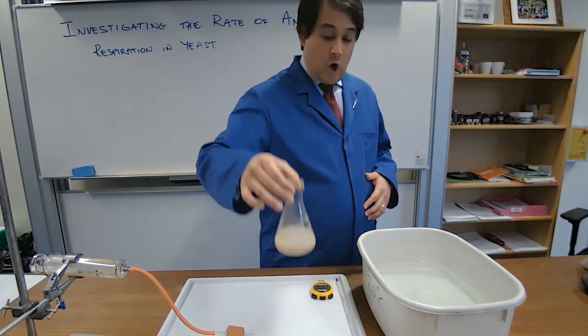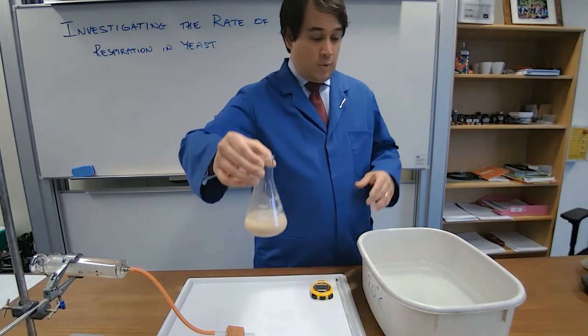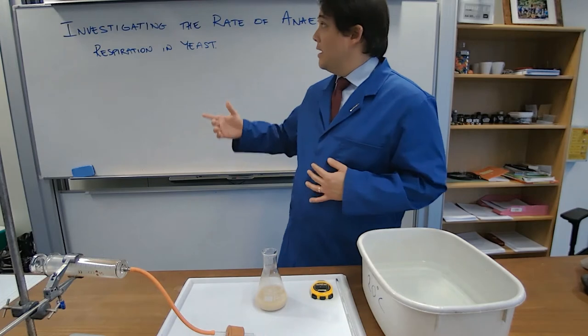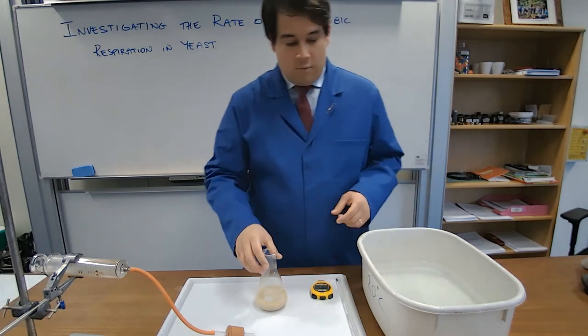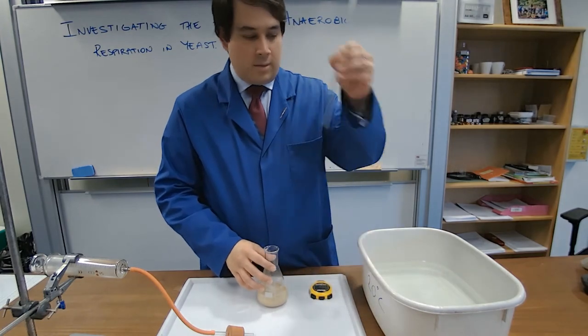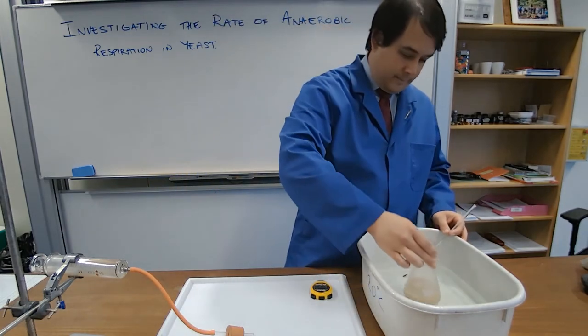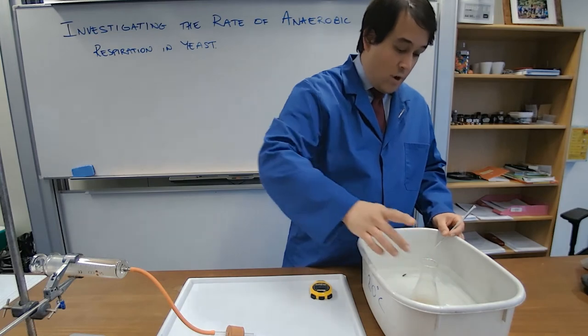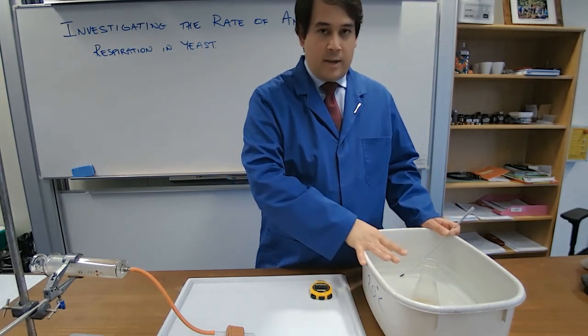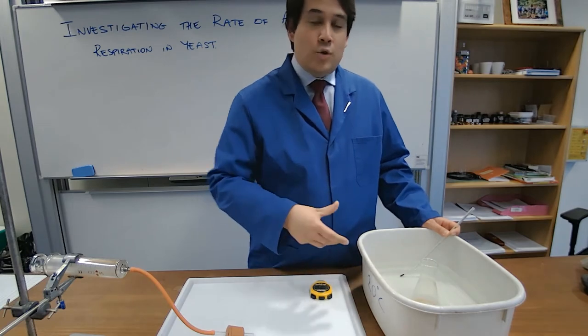Now that that's on, we then need to put that into the water bath at different temperatures. So, supposing we were investigating the rate due to temperature, we would then have water baths at different temperatures. Water bath, thermometer, yeast in. We are then going to allow the yeast to rest in here for 15 minutes so it acclimatizes to that temperature.